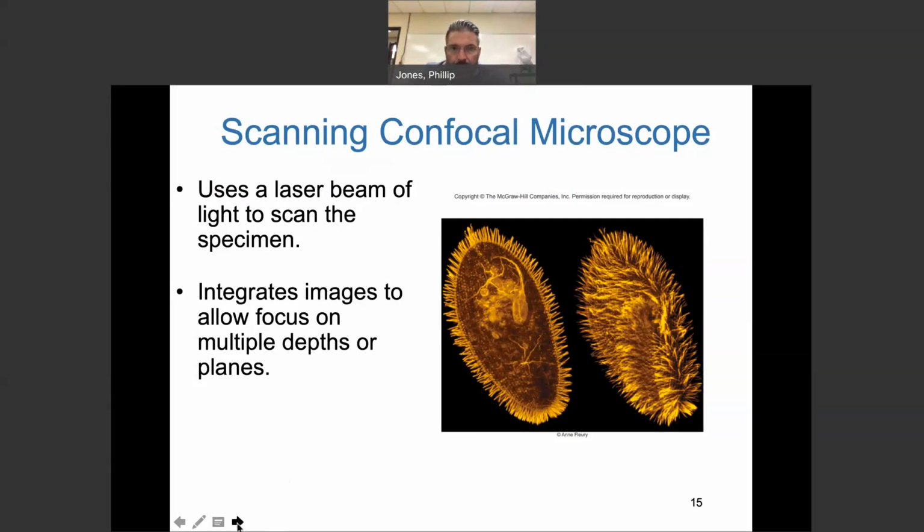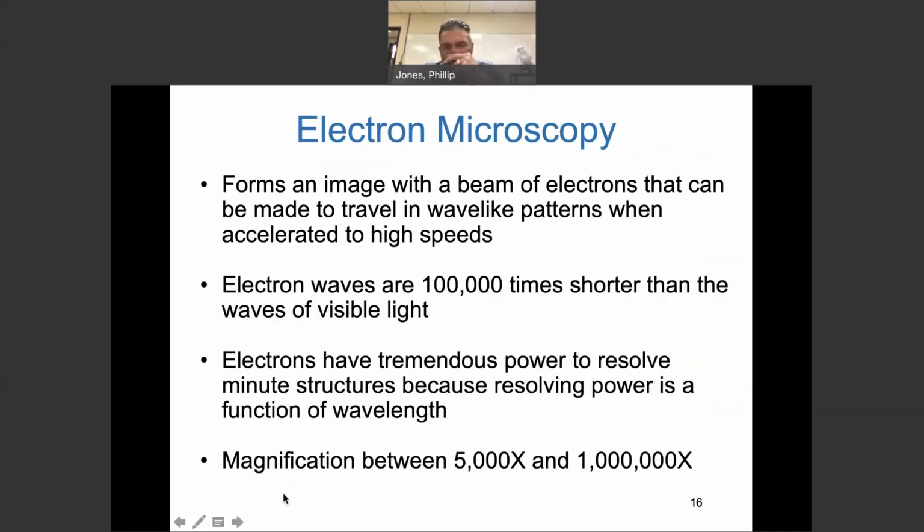Now, electron microscope, just realize this is what we are using now, or your textbook, a lot of books, or if you Google search something, it'll give you a scanning electron image of it. So it's super, super tiny. And if you look, magnification begins at 5,000, goes all the way up to 1 million. So we can look at viruses or super tiny nanoparticles with this.